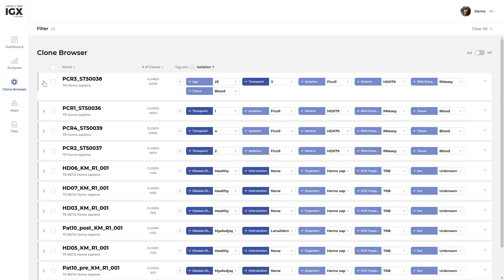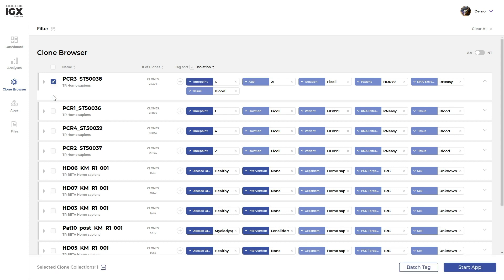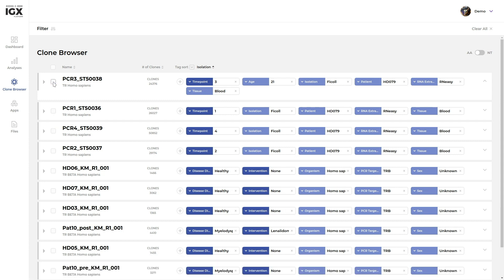To perform follow-up analyses, tick the checkboxes next to the samples or sequences you'd like to include and start one of the analysis apps. Alternatively, you can select a set of samples or clones using the search and filter tools of the clone browser.